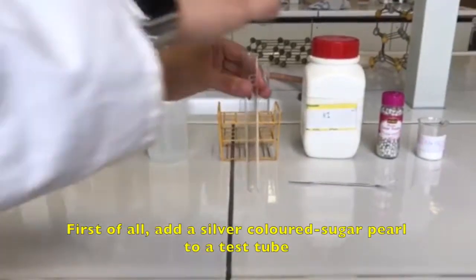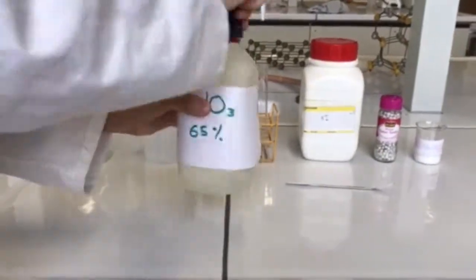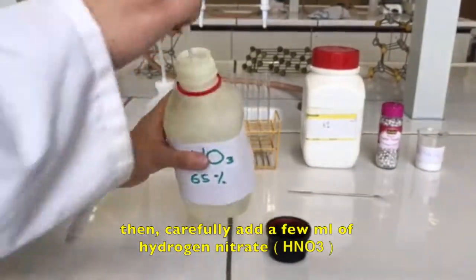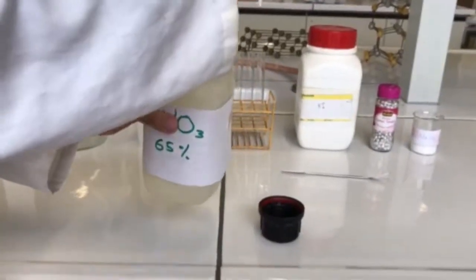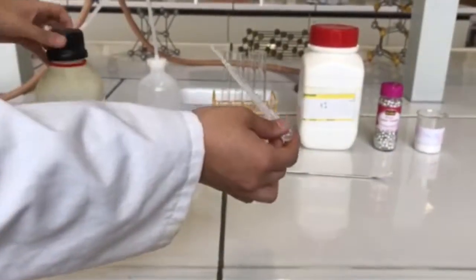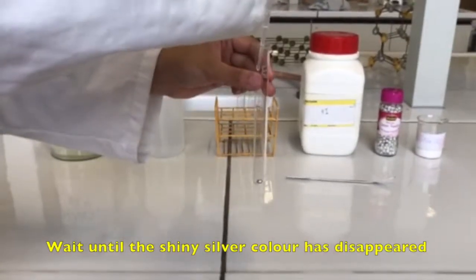First of all, add a silver colored sugar pearl to a test tube. Then, carefully add a few milliliters of hydrogen nitrate. Wait until the shiny silver color has disappeared.